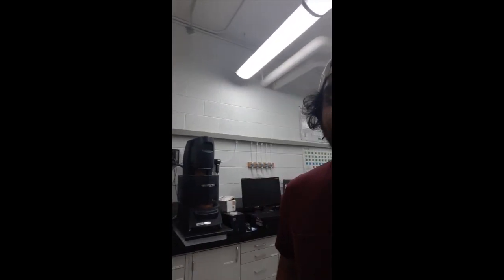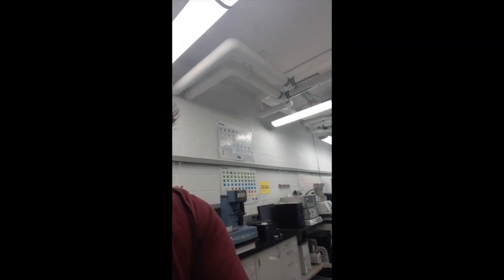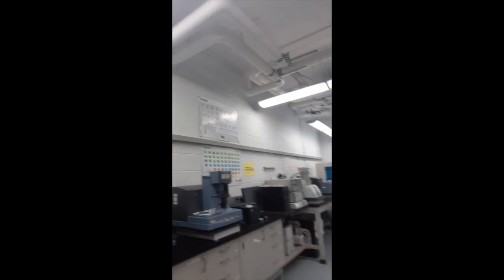So we see a lot of our polymer-derived ceramics with applications in batteries, aerospace applications, ultra-high temperature ceramics, and so on. We are personally working on silicon oxycarbide and silicon carbide derivatives. And to that extent, some of the work we do, we have to do a lot of characterization. So this is the characterization lab here at Virginia Tech in the Material Science Department. We have plenty of instrumentation back there. A lot of expensive equipment, but also a lot of good data that you get from that.